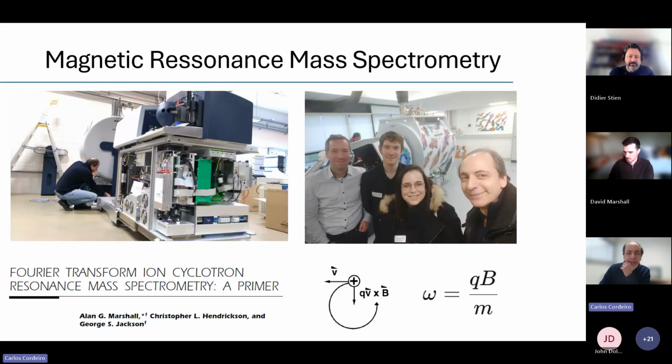So basically, these are two installations. This is the one in Lisbon on your left, and you have the other one on the right, which was installed last year in Rouen. And the main difference is actually the magnet. You have a higher magnetic field in Rouen, 18 Tesla versus 7. So this has some implications in terms of resolving power and dynamic range, but the effect is not as pronounced as in NMR. So basically, qualitatively, the results are always very similar.